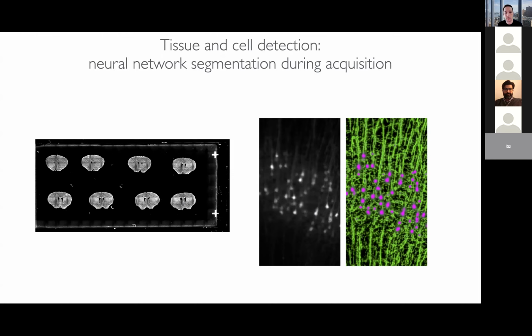And so we have developed, like, trained some networks for doing this, and BrainJ hasn't been fully adapted for the cell analysis coming from the slide scanner using neural networks, but it's something that is possible. And if someone's sort of eager to start using that, then that's something that I can add in. But just keep that in mind. We have these tools available, and I think it really makes projects a lot easier.